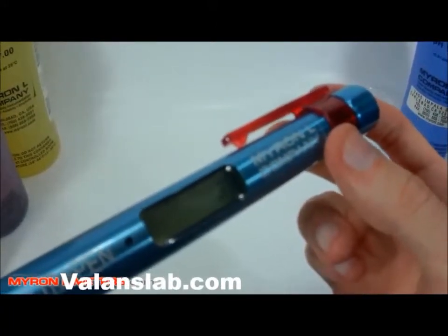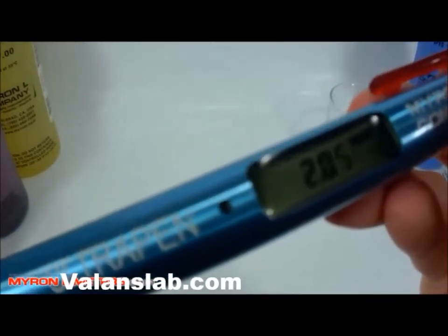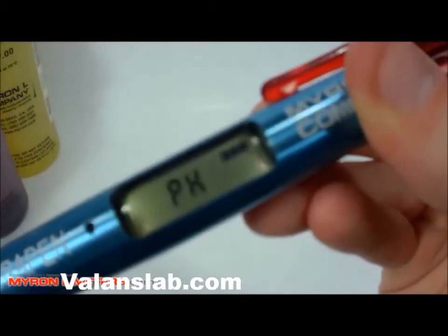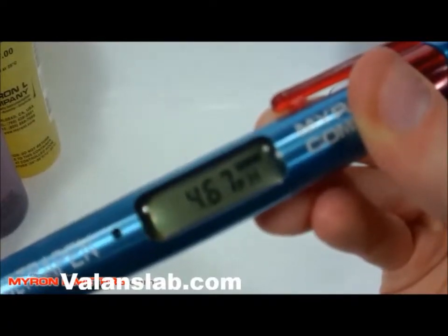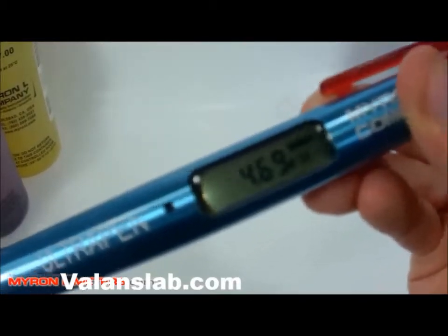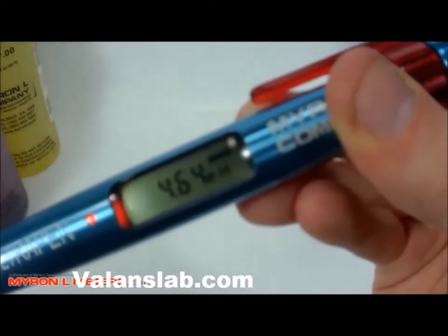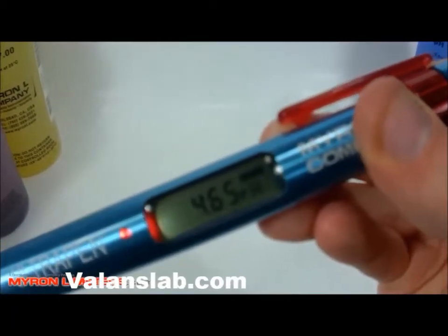Now that the instrument is in live mode, when we take a measurement sample, we press the button, it starts blinking, we put it in the solution and swirl it around. It's going to display a live reading of the pH and the temperature as the slow blink is happening. The values can change every time we see this on the screen. It's very stable since we've got the cap full of solution, but it will continue to give a reading until the instrument times out and turns off.